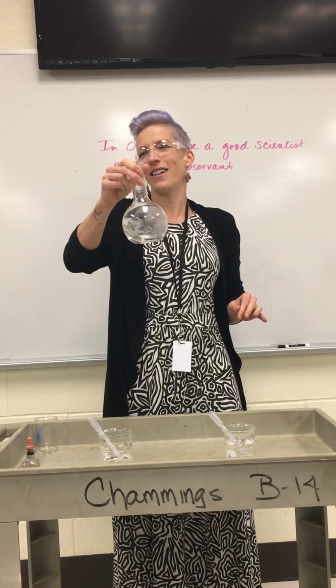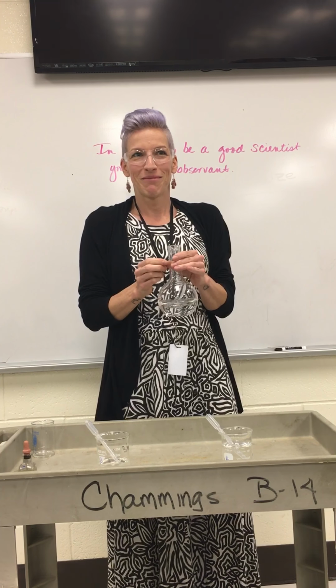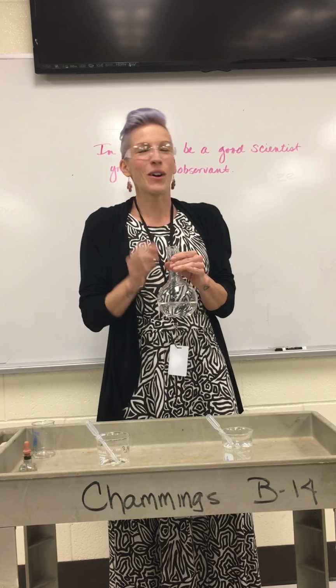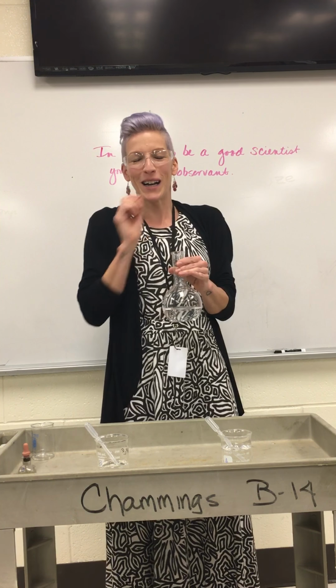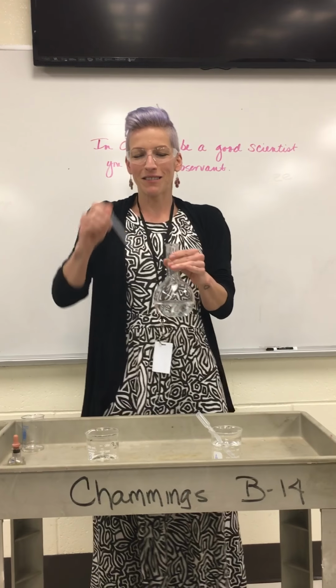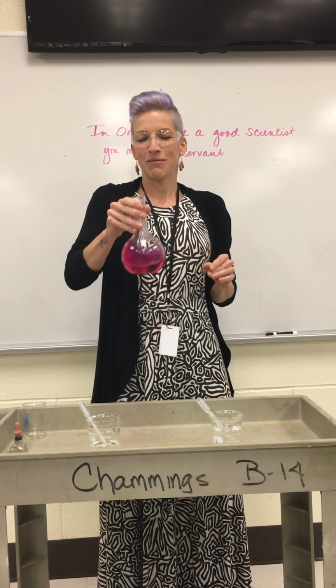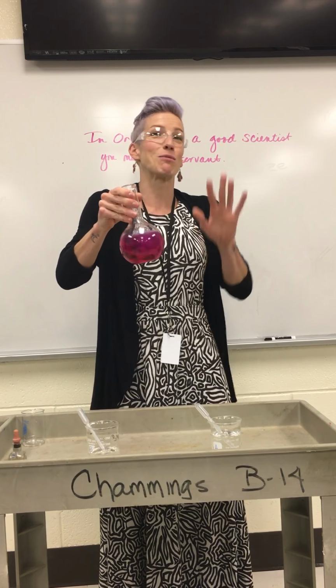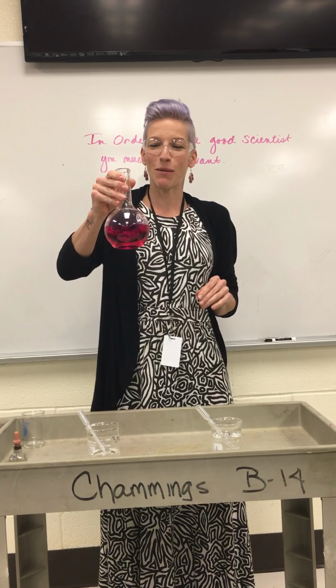Ooh, that took a while. What do you want to do? A. Do it at the same time. Okay, hold on. What about just a little more B right now? Okay. B. Because I don't want to get too far off track. What do you think's gonna happen? It's not going to disappear. It's not gonna explode. It should not explode. If it does, we got problems.